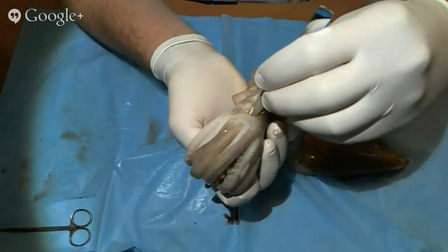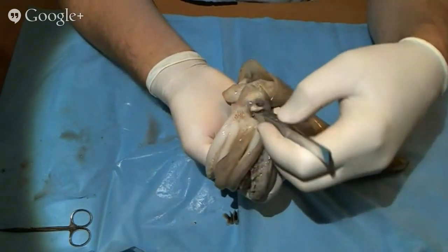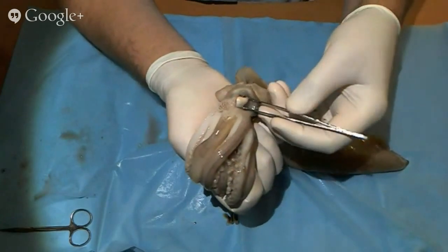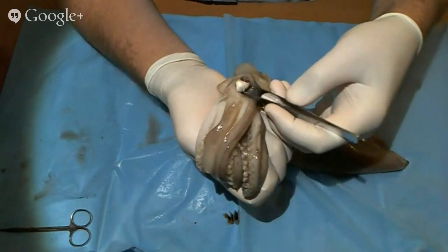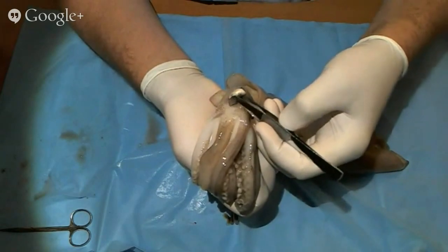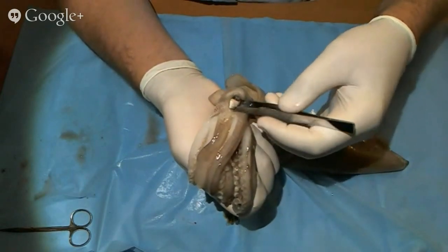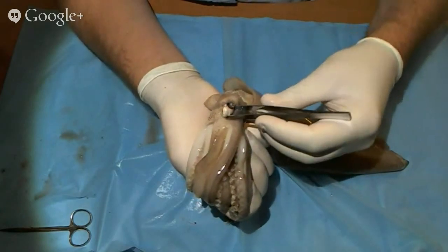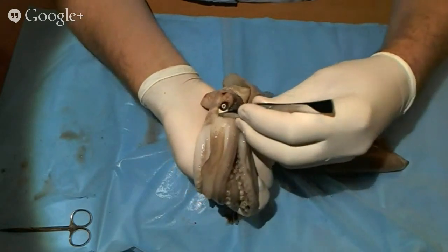They can get a really good view of that when they're looking at a squid like this. And then they might even notice that there's sort of an iridescence or a reflectivity of the eyeball on the back here. This is where you could try and correlate that to any eyeball that is starting to become an advanced eyeball. There's a whole series on the evolution of the eyeball on Nova, and if you want to go to that website, I'll put some links at the end of this video.